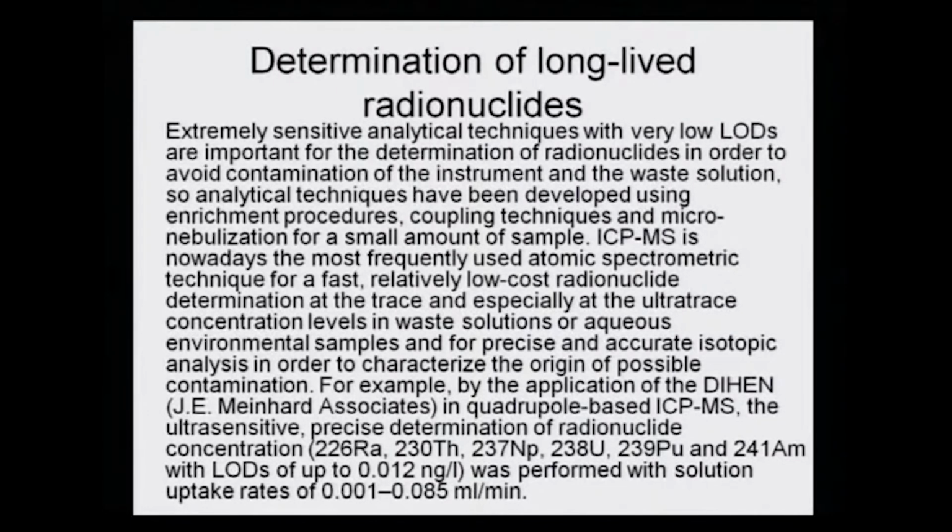And so, a very small amount of sample should be taken, by the method of enrichment procedure coupled with a technique which can do micro nebulization. So, a very small amount is going into the spray chamber of the ICP. That is the kind of adjustment, so that only small amounts of sample are even taken into the machine.